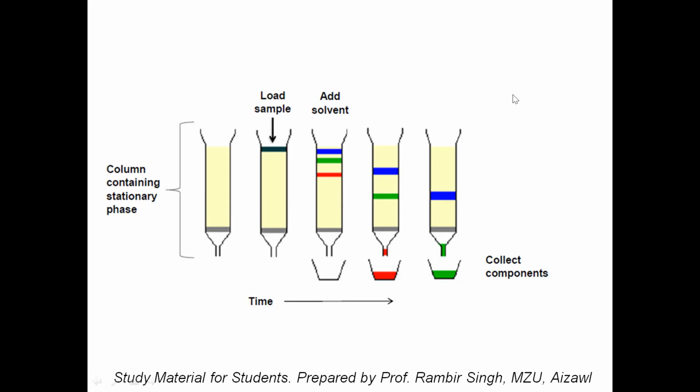When the interaction of the solute with the stationary phase is more, they tend to adsorb. And if they tend to adsorb, then their movement will be slow. That means a compound which is adsorbed on the stationary phase, its movement will be slow.